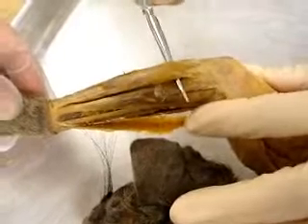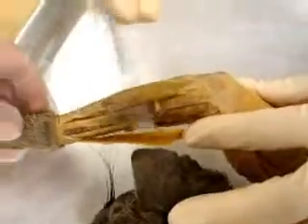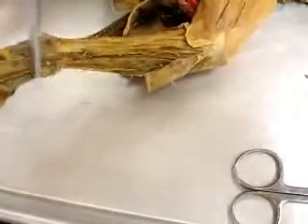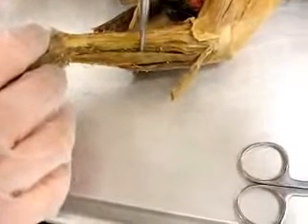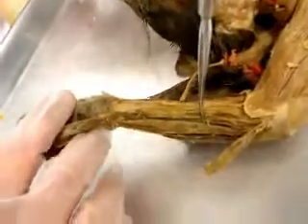On the very edge is extensor carpi ulnaris. Moving to the flexor muscles: this is palmaris longus — as you can see, we bisected it already. Underneath that right here is flexor carpi radialis, and flexor carpi ulnaris.